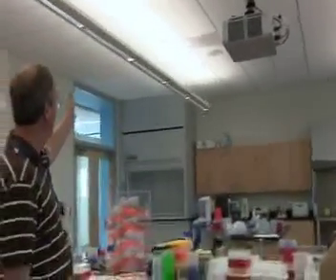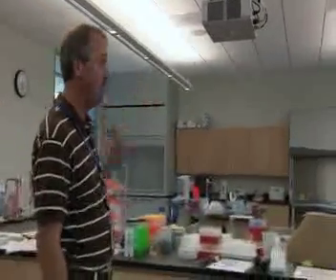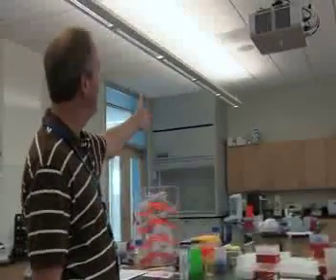We have a chemical fume hood in the back there. We have a biological safety cabinet for students working with strains of bacteria. We have a real-time PCR machine, standard centrifuges, shaking incubators, things you have in a standard laboratory that you would find at the Stowers Institute or academic and other business institutions in the area.